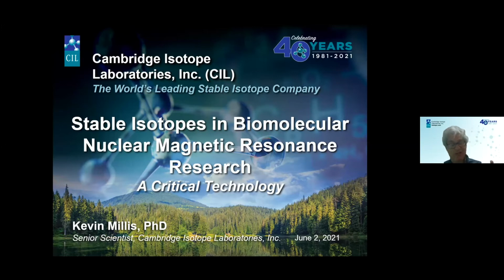So one can use X-ray crystallography or cryo-EM to get structural information, but it is only NMR that is suited to study molecular targets under or near physiological conditions. This is in solution or even in living cells.